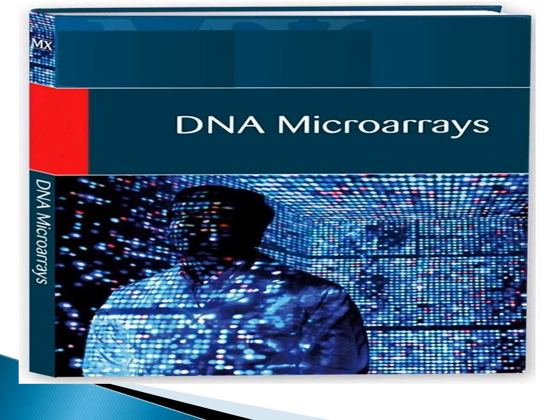So DNA microarray is a very powerful tool for the analysis of whole transcriptome in transcriptomics and expression profiling. So array means orderly arrangement of objects or things. So in case of DNA microarray, we arrange single-stranded oligonucleotides on a very small surface area of the glass slide, and that is why it is called DNA microarrays.